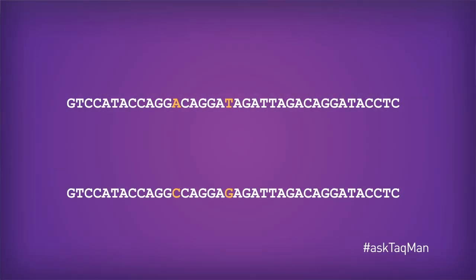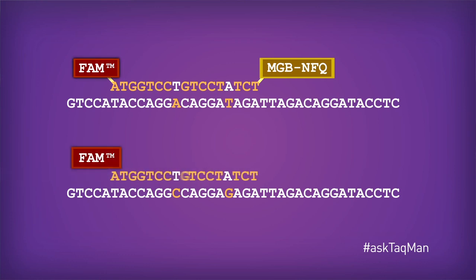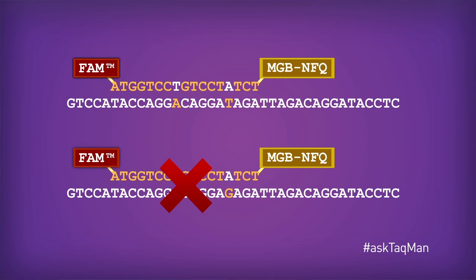But if I redesign that probe as an MGB, it's of course much shorter, and as a result, those two mismatches are a much higher percentage of the total length. So while the probe still binds perfectly to my target of interest, it has much less affinity for the mismatched sequence. And that makes us very happy.